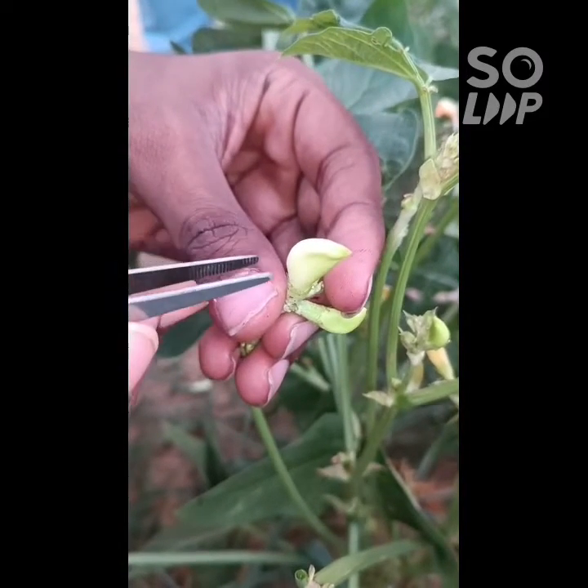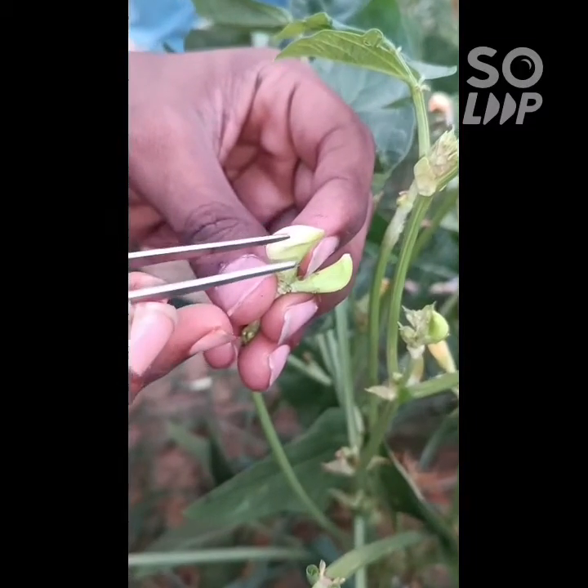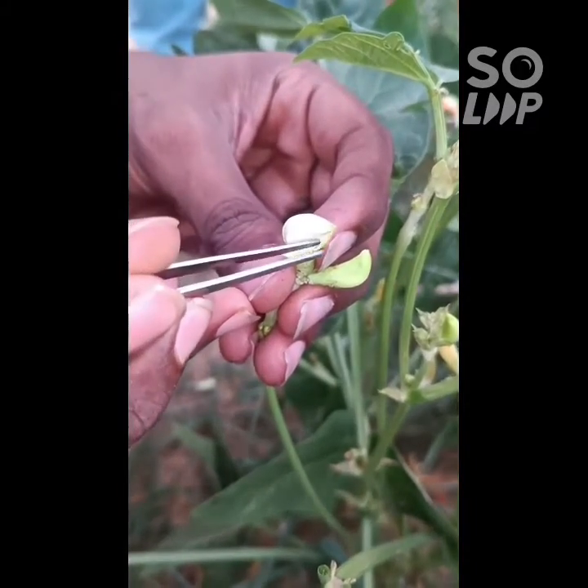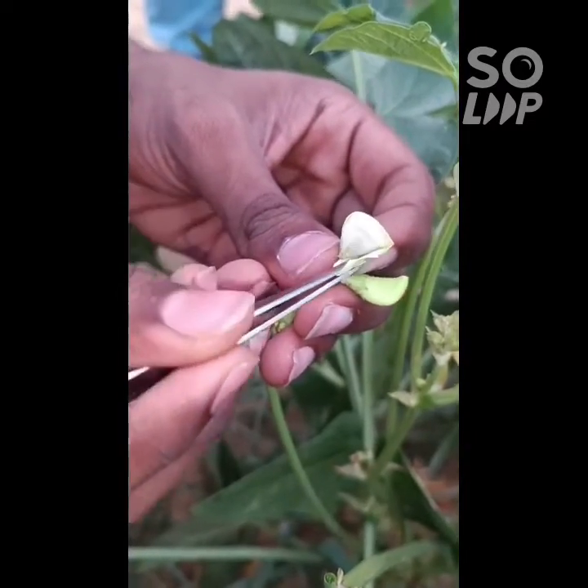Emasculation is the removal of the male part of the flower so that the female part can be crossed with the desired male parent. First we will remove the outer sepals and petals of the cowpea flower.